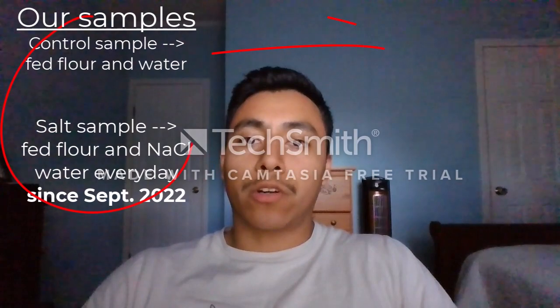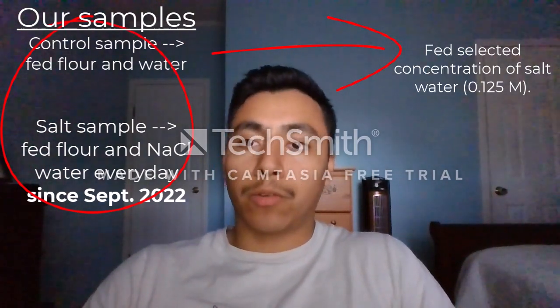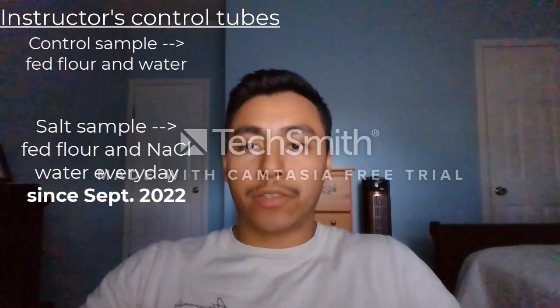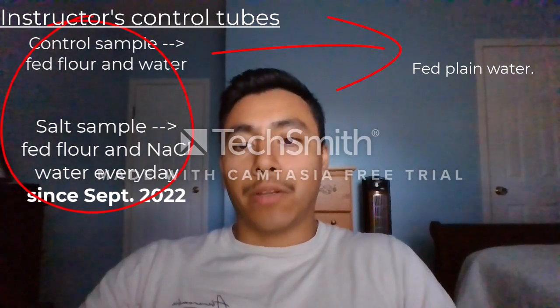Again, these sourdough starters are fed the selected concentration of salt water. In our case, it is 0.125. These two starters are again compared to our instructor's control tubes, one being the control sample and the other being the salt sample, with the same procedure. These will be the sourdough starters that are fed plain water.